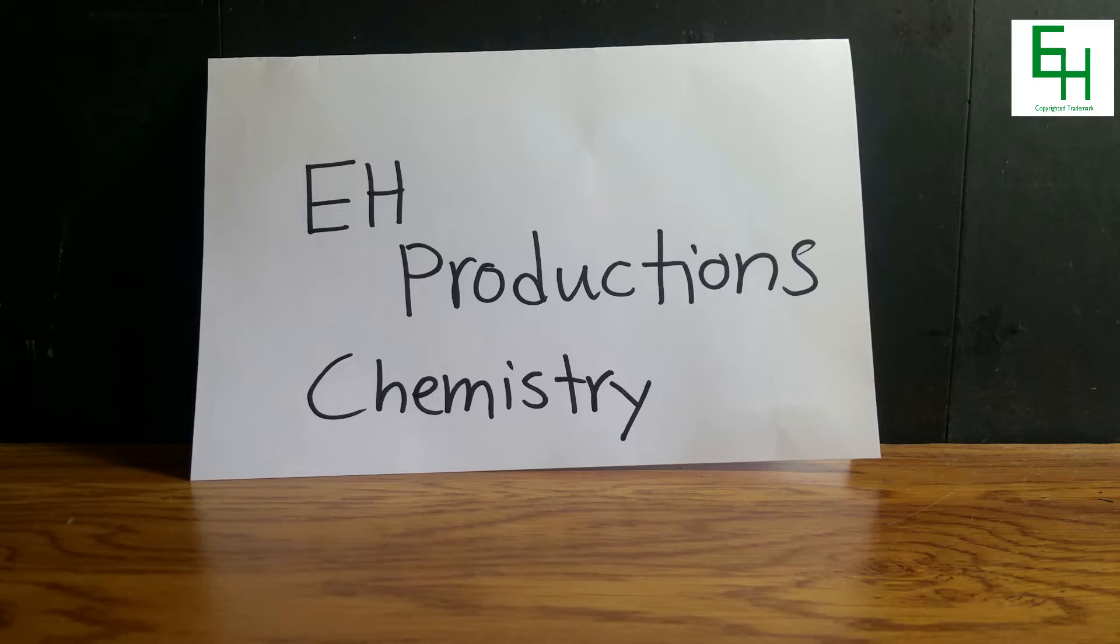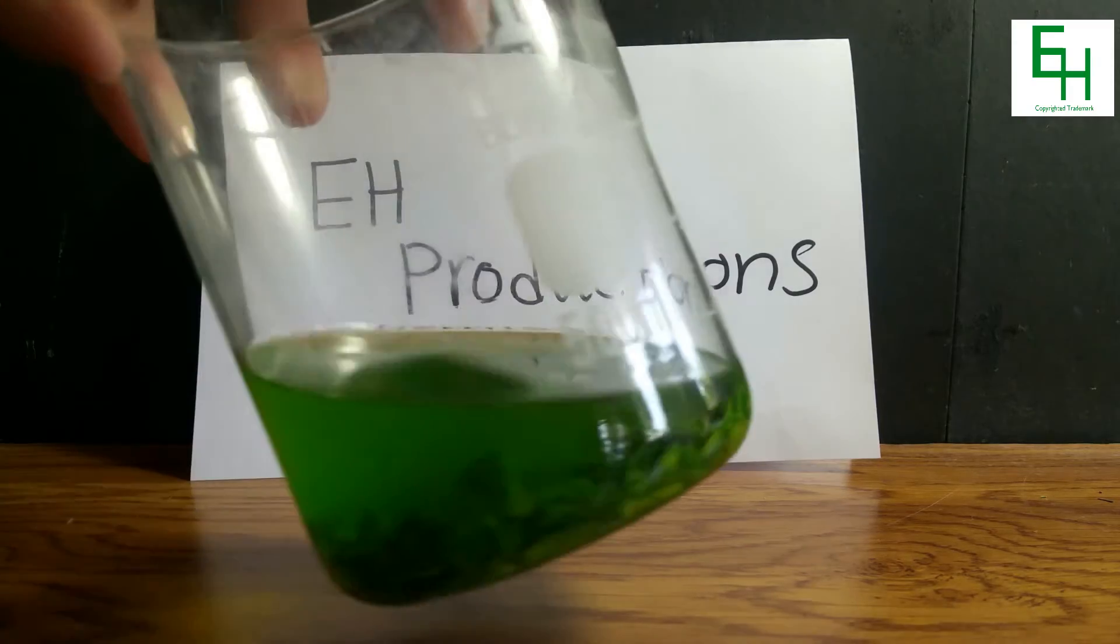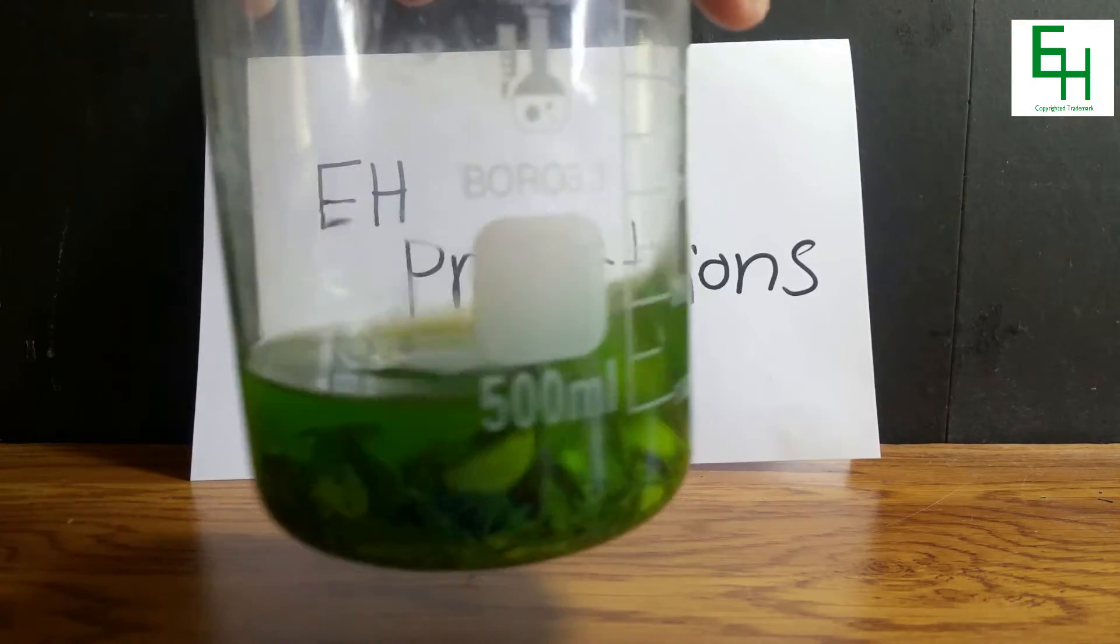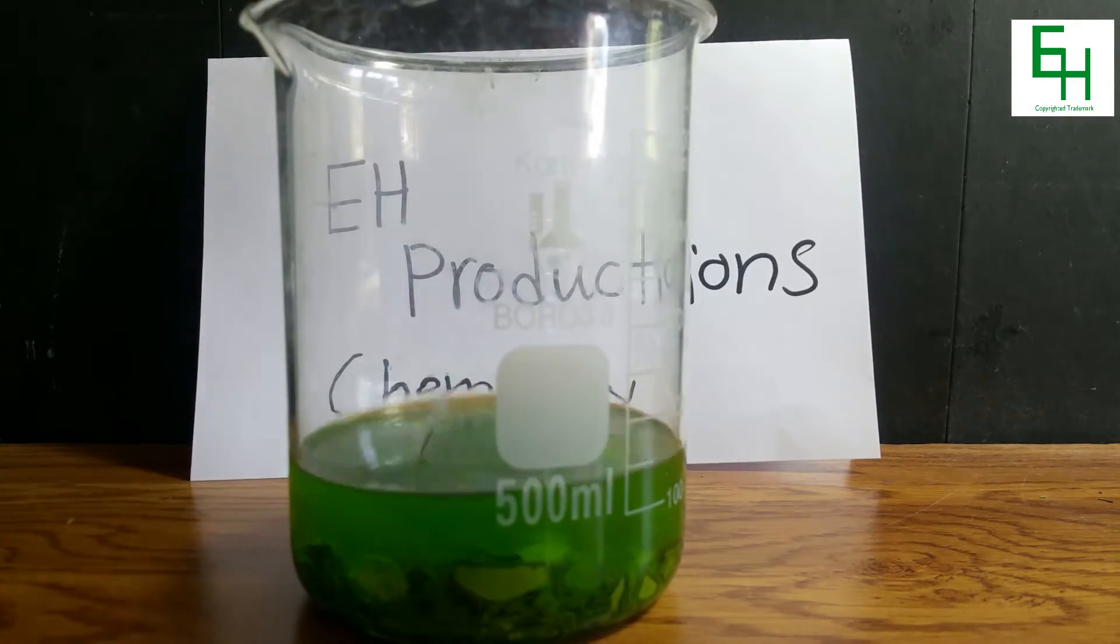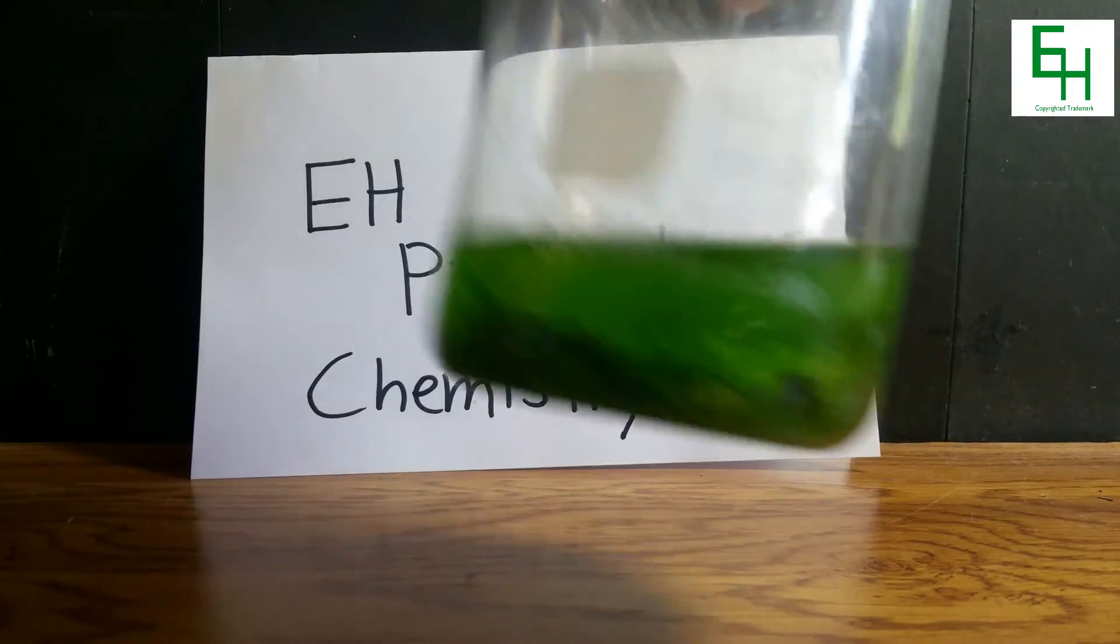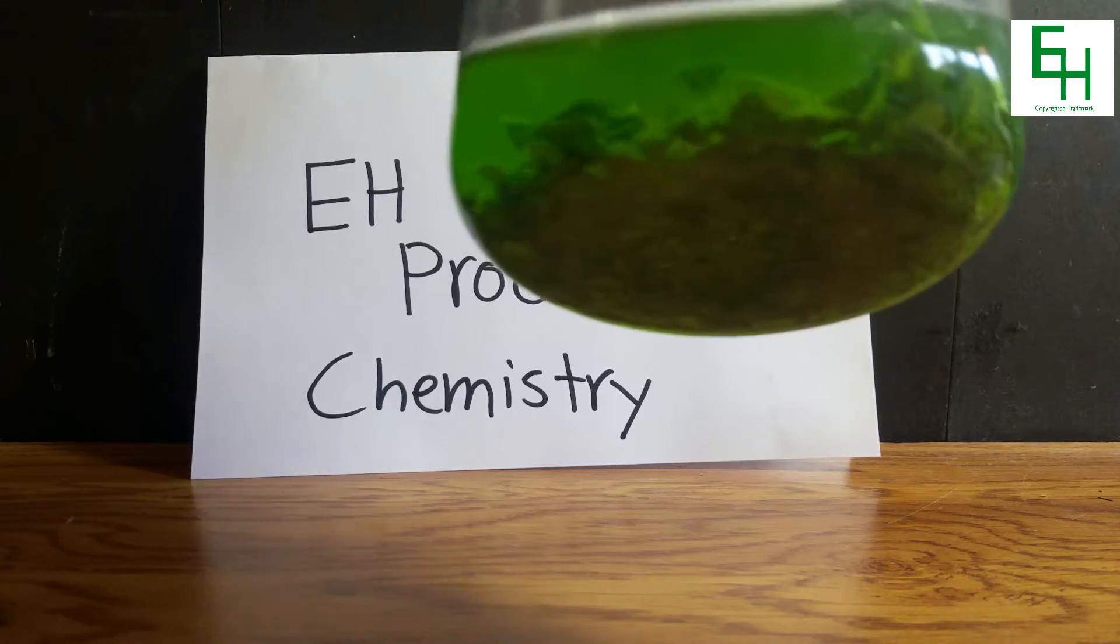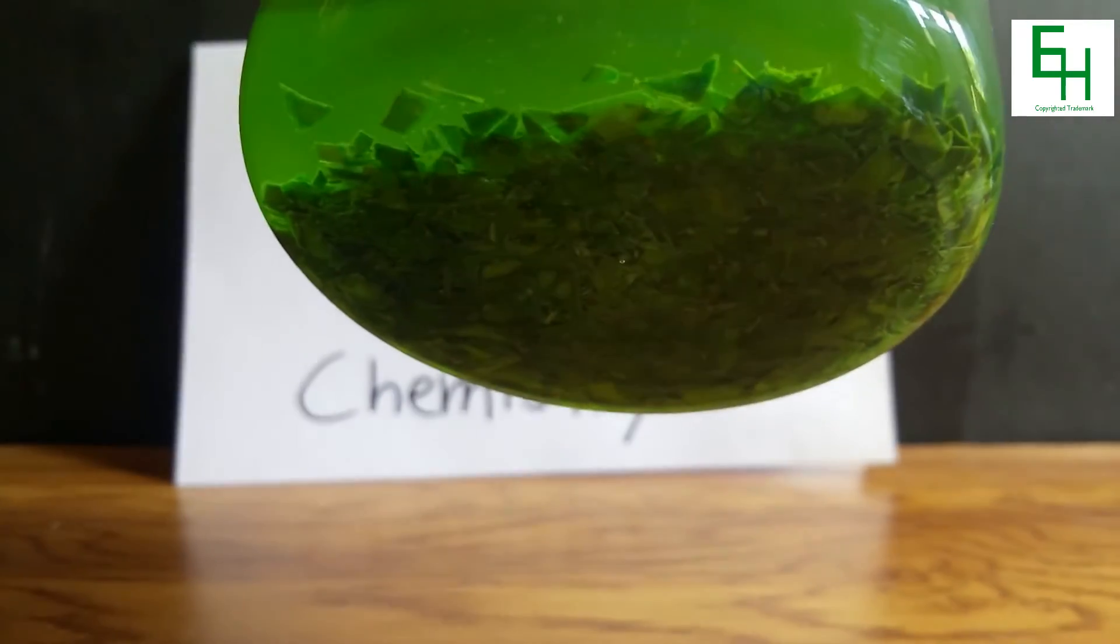Alright, so after about an hour or so, this is what the chlorophyll mixture looks like. So what I'm going to do now is filter the solution so we can get rid of all the small leaf particles.